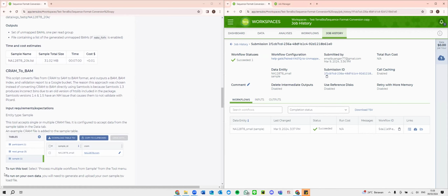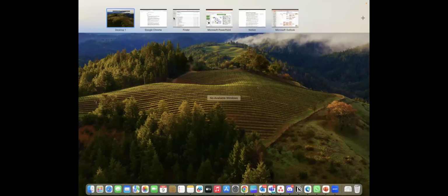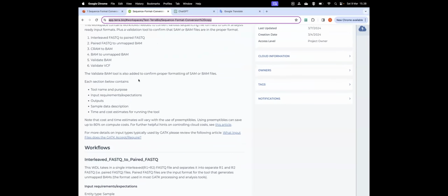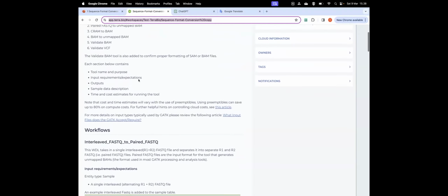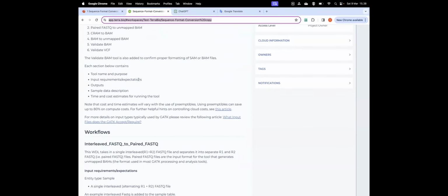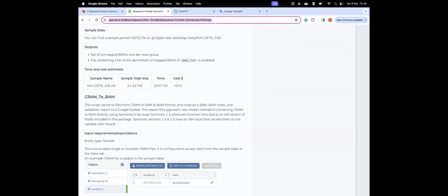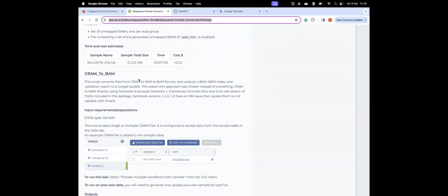All right, thank you, Jacqueline. Okay, let's move on into the next step. The third one is CRAM to BAM. Okay, so we need to convert from CRAM format to BAM format.